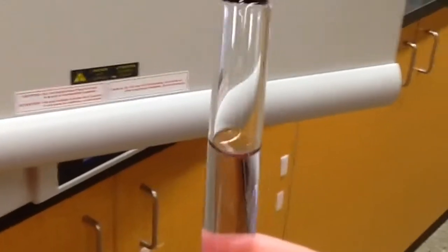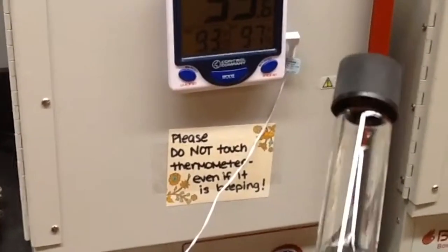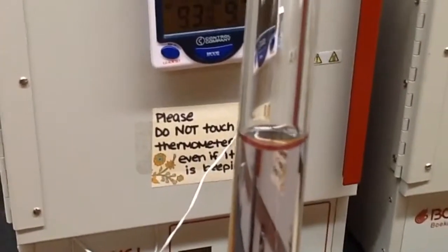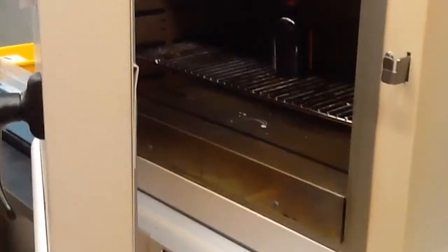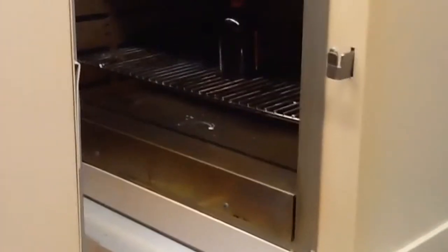and we place it into a growth medium, and then we will put it in the incubator for a set number of days. For this one, it is 5 days. And if there's any growth in this growth medium at the end of the 5 days, then the oven did not do its job, and it must be retested. So that is the entire process of our Cyclosporine eye drops to get it sterile. After it's sterile, then I'm going to show you how we transfer it into our eye drops.